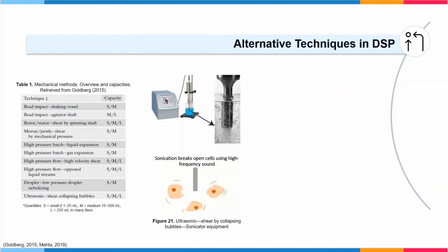The operation starts with normal electrical current, around 60 Hz, being transformed to 20,000 Hz. This electrical signal is fed to a piezoelectric crystal, causing it to oscillate at this high frequency. The vibrations move a titanium metal horn in the fluid, moving the liquid forward and retracting quicker than the liquid can return. At this point, the pressure in the system drops below the vapor pressure of the liquid, so boiling occurs, as cavitation. As the liquid flows back, the bubbles collapse, which imparts the energy needed to disrupt the cells.